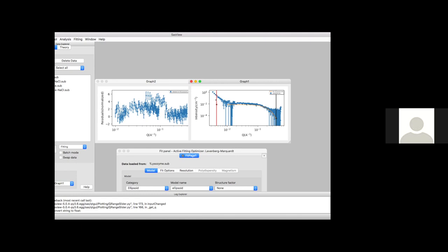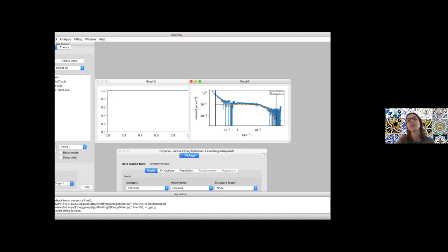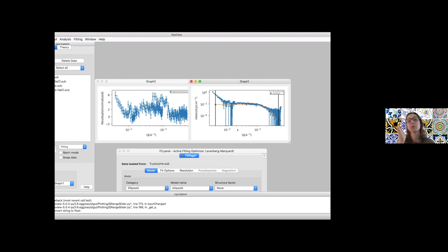Okay, you just have to be careful not to fit noisy data, but you can, just to test, because you're playing with it now. You want to see what the program can do. You could stretch that out, so you will have more data parameters, but you can see that they're noisier. So it's something you do have to play with when you have your data. But that's one of the reasons why I wanted to give you realistic data, not data that has a perfect plateau where you never wonder where to cut your data, because that's not what's going to happen with your sample. Very probably, because biosamples are temperamental.